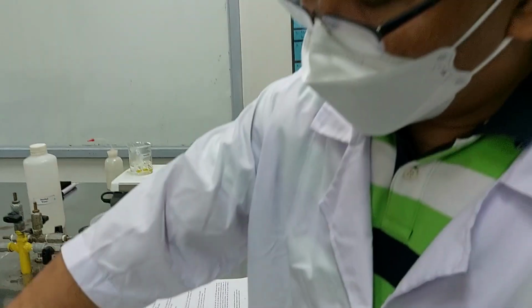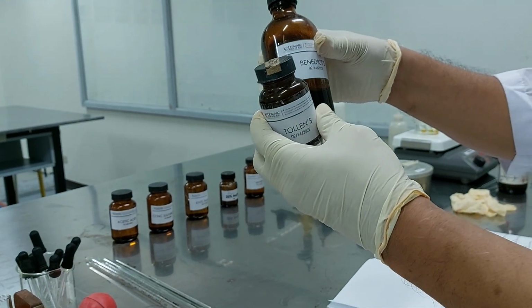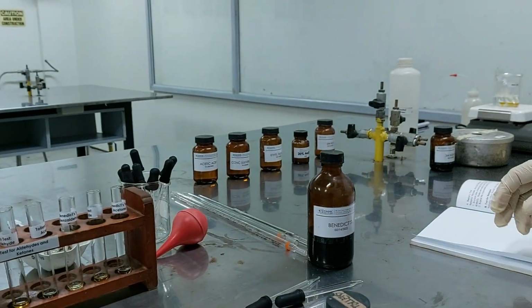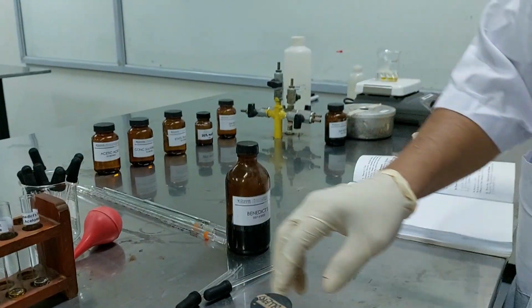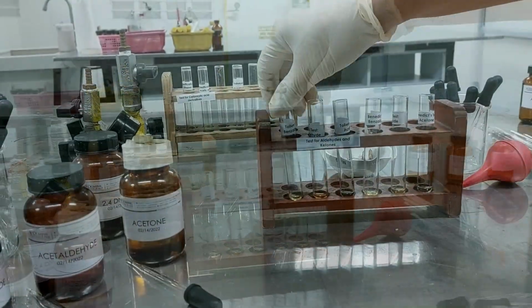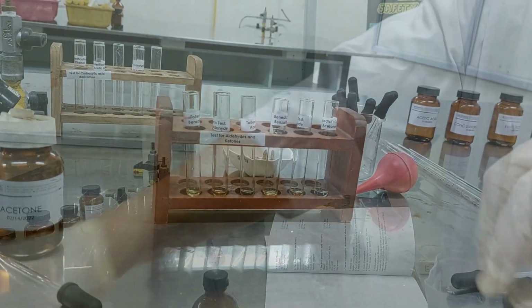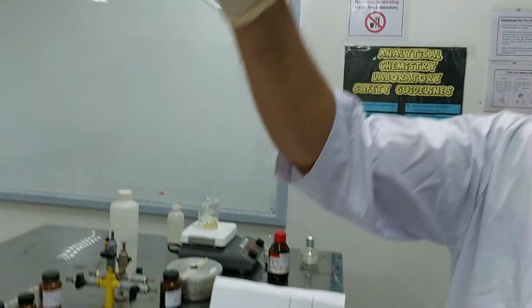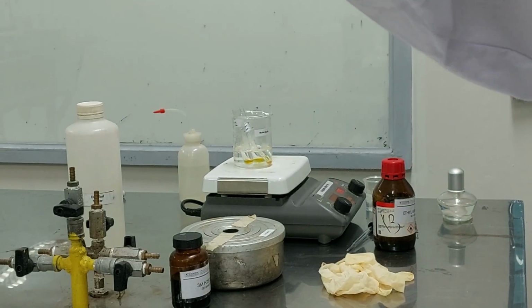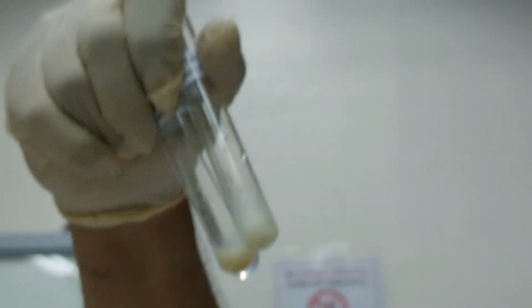Alright, so now let's go to oxidizing agents. We only have two oxidizing agents here, Tollens and Benedict's. We don't have Fehling's reagent, but this is enough to differentiate aldehyde from ketone. So let's start with Tollens reagent. Let's add 10 drops of this Tollens reagent. You have a fast reaction here. We'll heat this one so that we can observe the silver mirror. We should be able to observe that mirror.